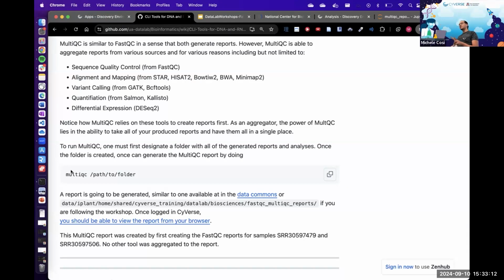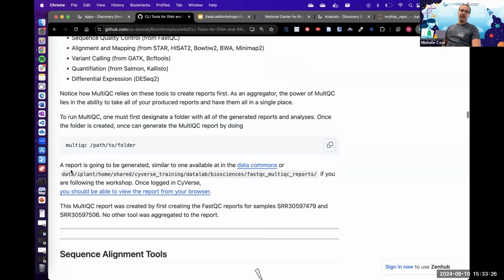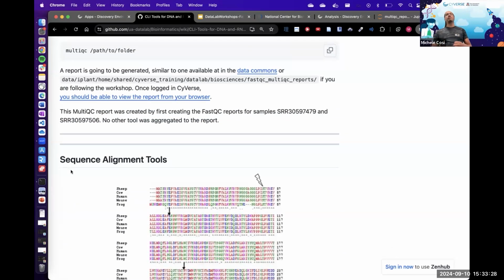So these are the two tools. There's another one that I want to talk about, but I decided that we didn't have enough time. These are the two tools for quality control that every bioinformatician needs to know. Now, I know that all of you have been so wanting to talk about transcriptomics, but we need to first take baby steps and understand alignments. What is the most famous alignment tool? Starts with a B, ends with a last.